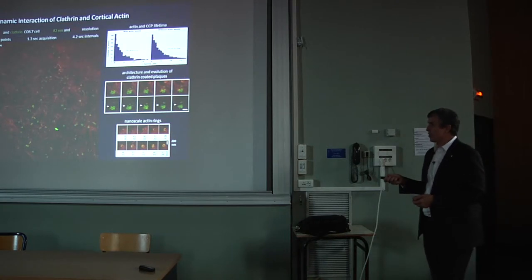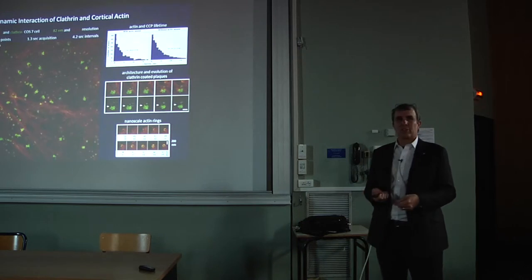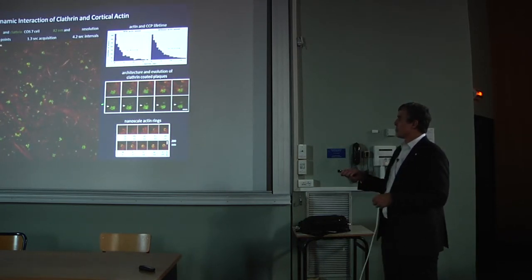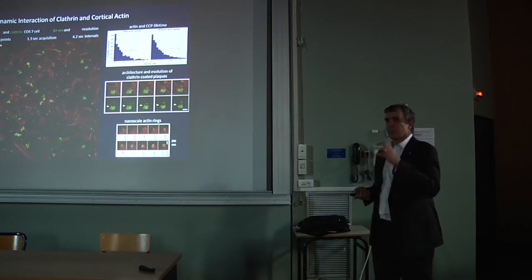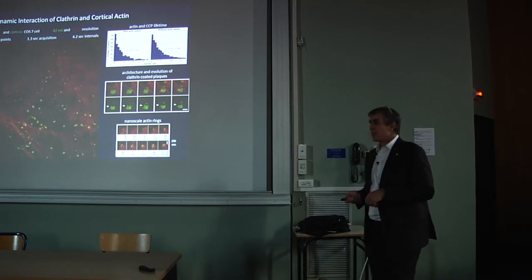We also find that there are not just individual pits, but these larger aggregates of pits called plaques, which have been reported in the literature before. But what we see is that these plaques are always just aggregations of pits, and they spin off individual clathrin-coated pits from them.